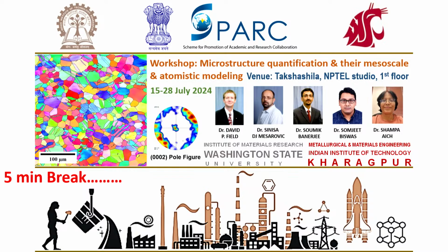Right. Okay, so this is just a data set, just an EBSD data set. Let's say we want to know the volume fraction, let's do a new chart. Let's say we want to know the volume fraction around a specific orientation component, right? So we're going to go to a crystal orientation plot. If we want to do a fiber, we're going to do a crystal direction plot.